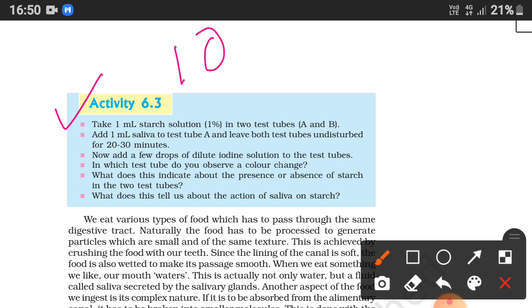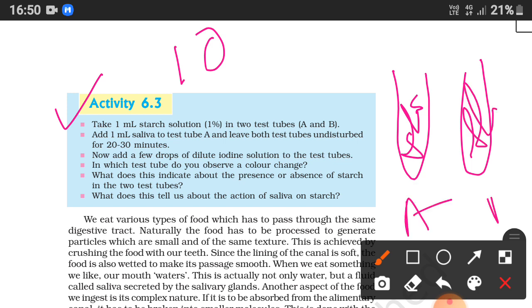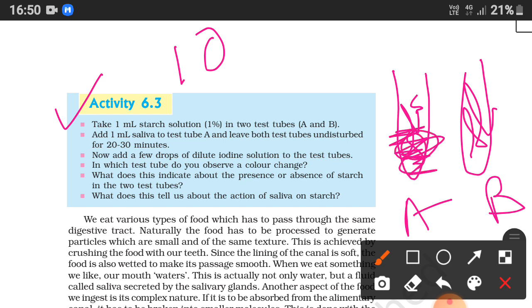Take 1 ml starch solution at 1% in two test tubes. You have to add starch in both of them, and in test tube A, add 1 ml of saliva.